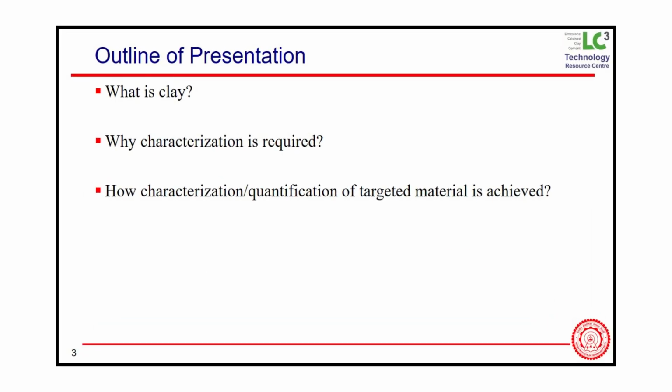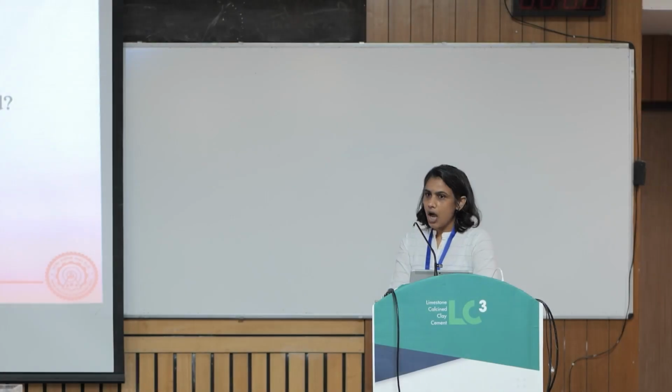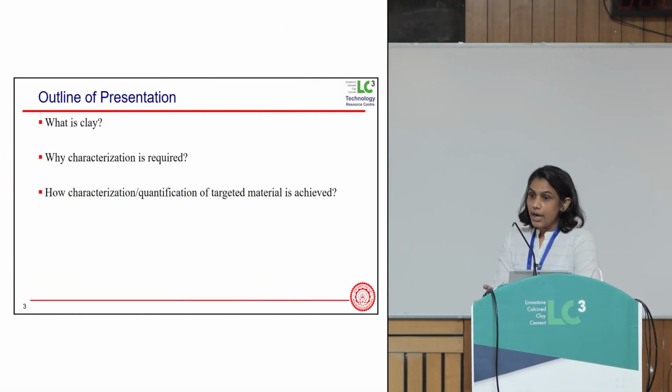So I will be speaking on what clay is in a generalized manner and why characterization is required, then how the quantification or identification of a particular material will be done from the LC3 production point of view.